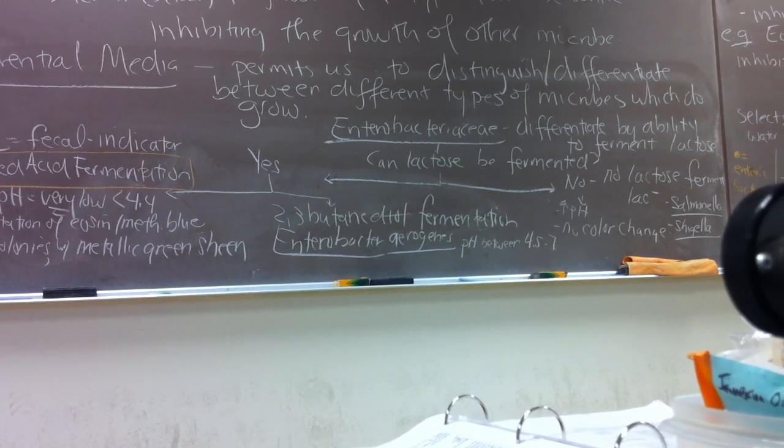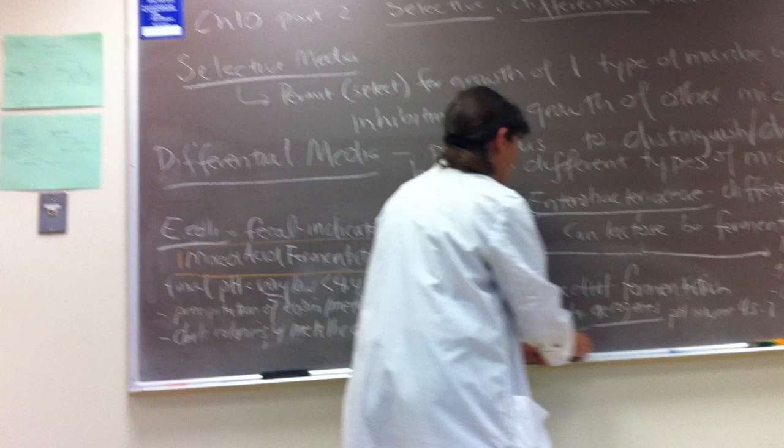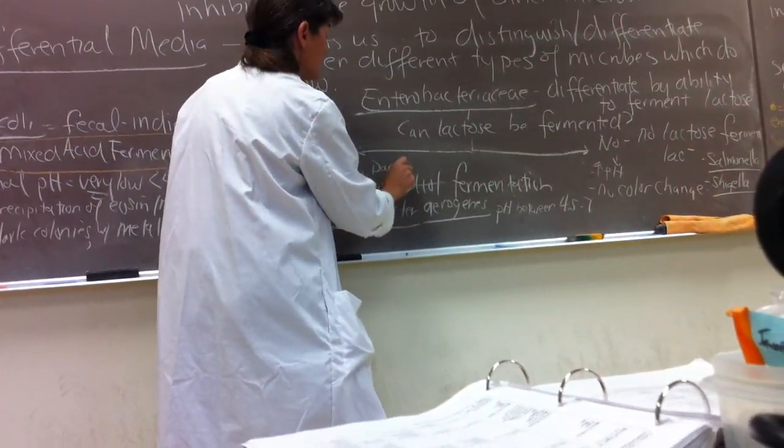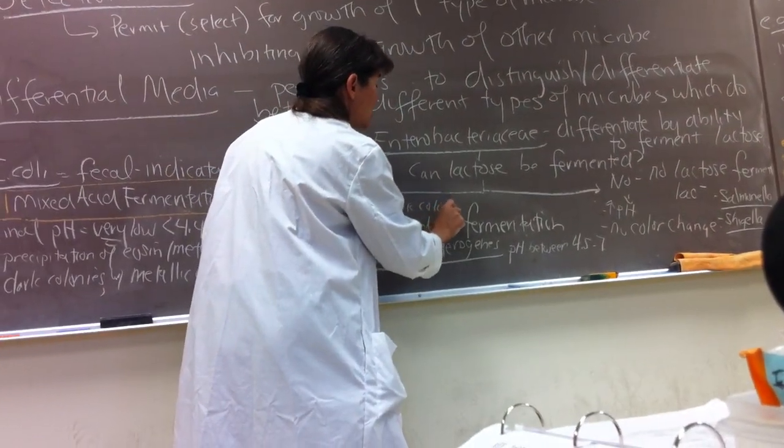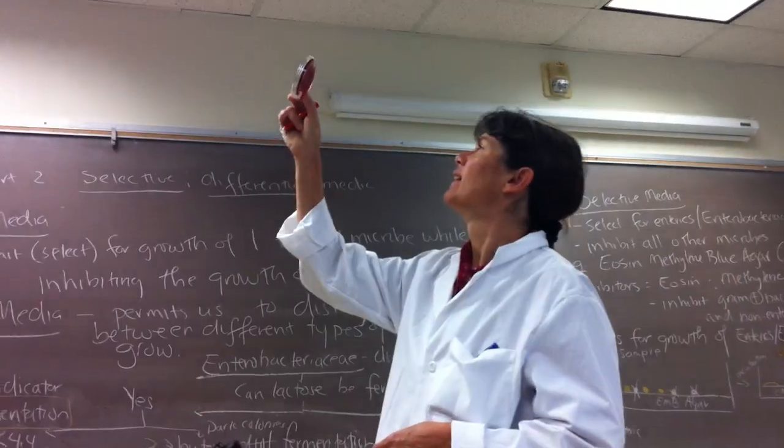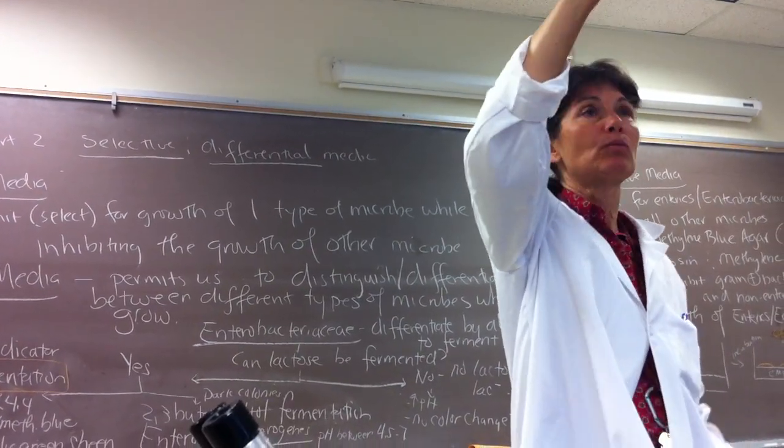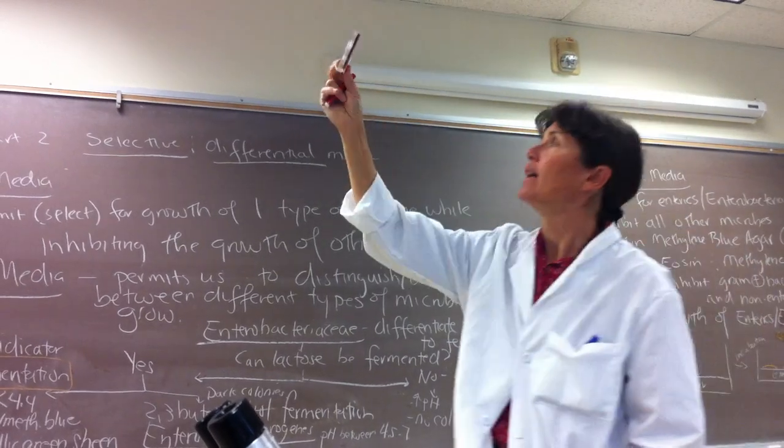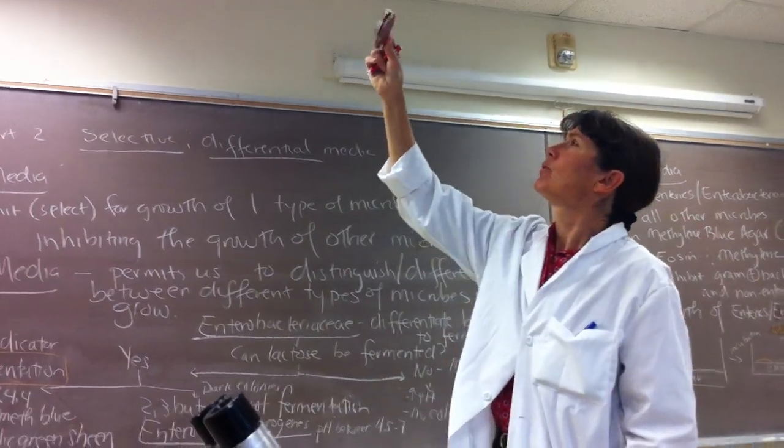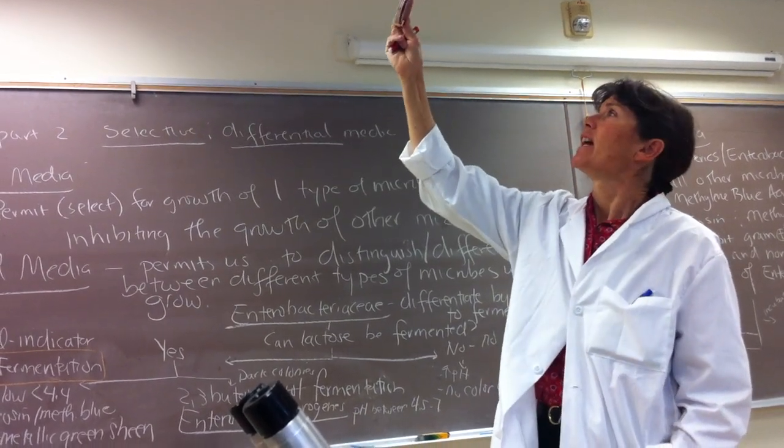And it turns out this little bit higher pH causes the colonies of Enterobacter aerogenes to appear a little bit differently on the plates. They too will have dark colonies, but there's no metallic green sheen. And again, on these plates, since they're a little bit old, this might not be too dramatic. If you hold up the triplate, which means we have three different organisms on it, and if you hold it up to the light, you can see the E. coli has the darkest colonies.